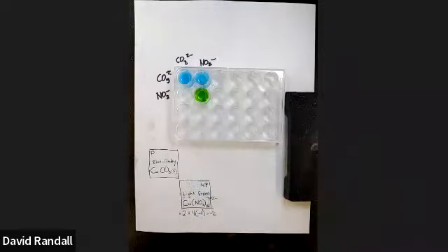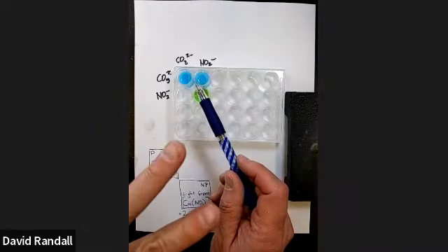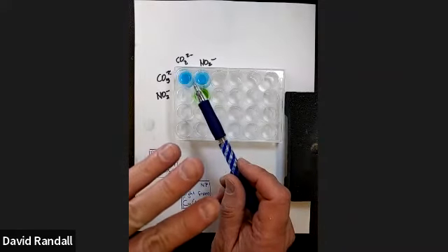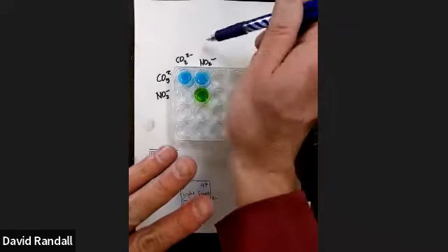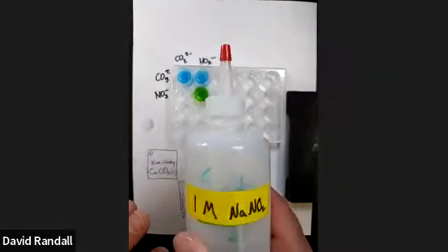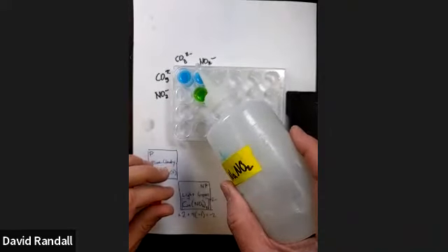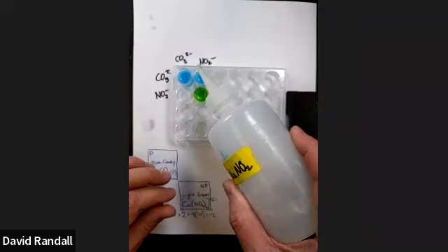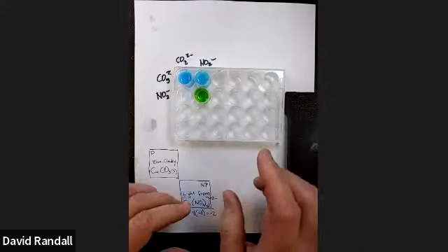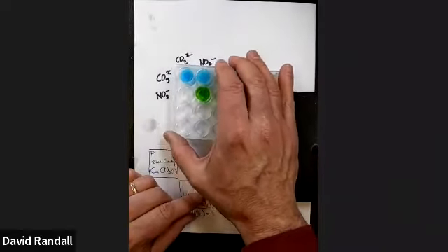All right, so we have in here copper carbonate. The second thing was the sodium sulfate, or not sulfate, but the sodium carbonate. So now we need to add the third thing, which is our source of nitrite ions. Okay, let's get it out. There it is. 1, 2, 3, 4, 5, 6. Okay. So you saw me add the nitrite. I'm going to stir it around.